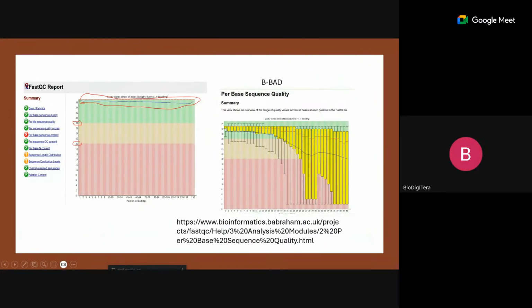Each plot is equal to one base. You can see here, there is what we call position in read. Base 1, this is its quality here. Base 2 till base 150. But if you see the same here, you will see that one plot appears here. It means that the quality is not good, but we can accept. But if you go till around 30 here, you are still in the green. Here, see.